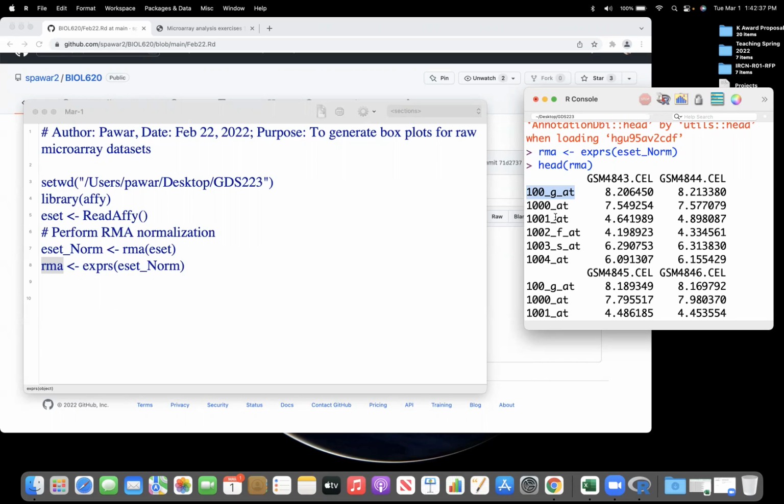So now we will do our analysis. First, we will do the analysis. We will find interesting genes and interesting IDs from this data. Then we will use the platform ID, and then we will know which are those interesting IDs and interesting genes matching. Okay, so let's start the analysis.